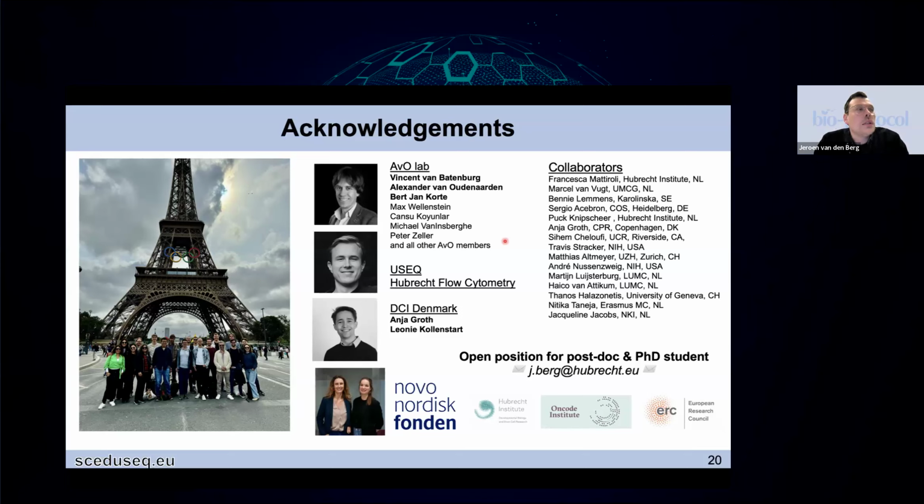One caveat, though, would be that for most forks, we retrieve somewhere between 5 and 10 reads if we do a single pulse. I think that's a little bit on the lower end of what we would be comfortable with, because we need to divide that number by 2. So then we have 2 or 3 reads on the leading and lagging strand. So we need to think about our labeling strategy a little bit as well. But yeah, it's definitely an option, and I would really love to think about that.